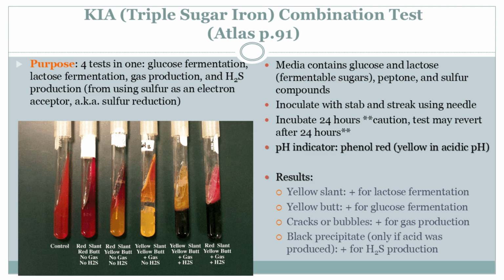So what about if we see a test tube where it's all yellow? Slant and butt, but totally yellow. Now that's a sign of a real sugar fiend. Yellow slant and butt means those bacteria are happily fermenting both the glucose and the lactose. They like a complex meal, those ones. They're not afraid of a little sugar rush. I like their style.